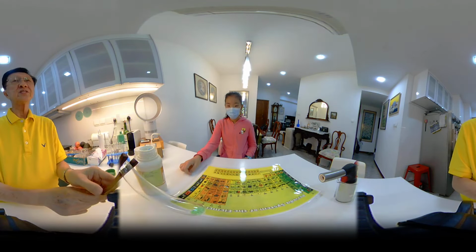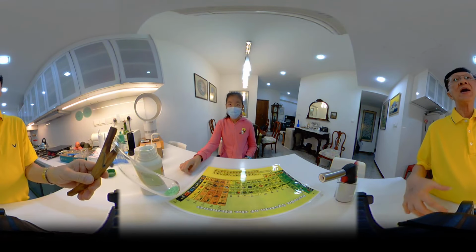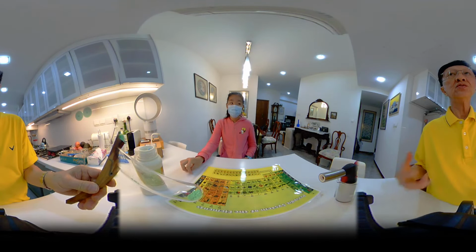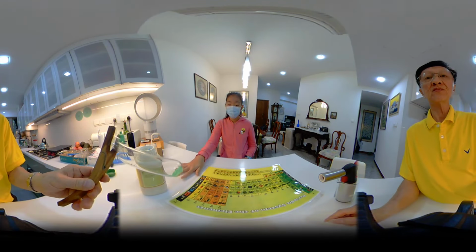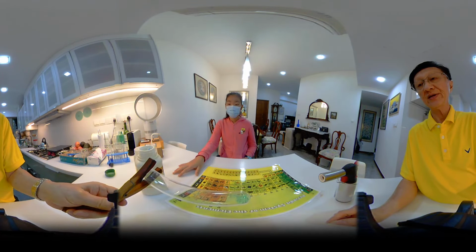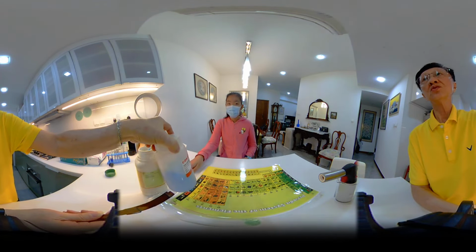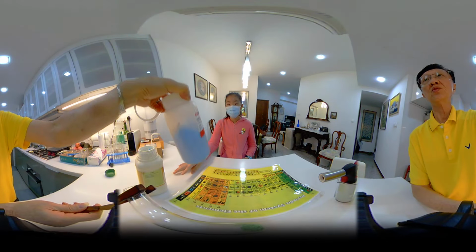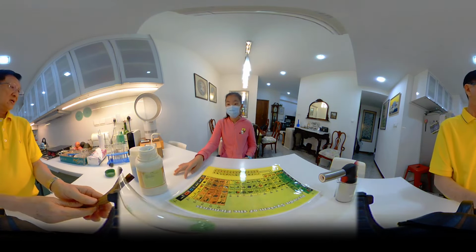So a lot of transition metals, when they form compounds, have got colored solids. And when you dissolve them in water, some of them will not dissolve. Like this nickel 2 carbonate is green, it will not dissolve in water, but copper 2 sulfate will dissolve in water, and it gives you a blue solution. This one is green.